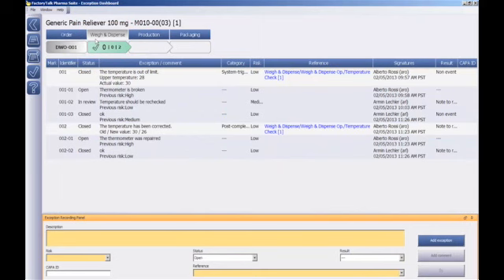Before leaving this dashboard, let's take a quick look at another feature of PharmaSuite. Selecting the second or third button on the left generates either a PDF or an HTML version of the executed batch record. We select an HTML version of the executed batch record.